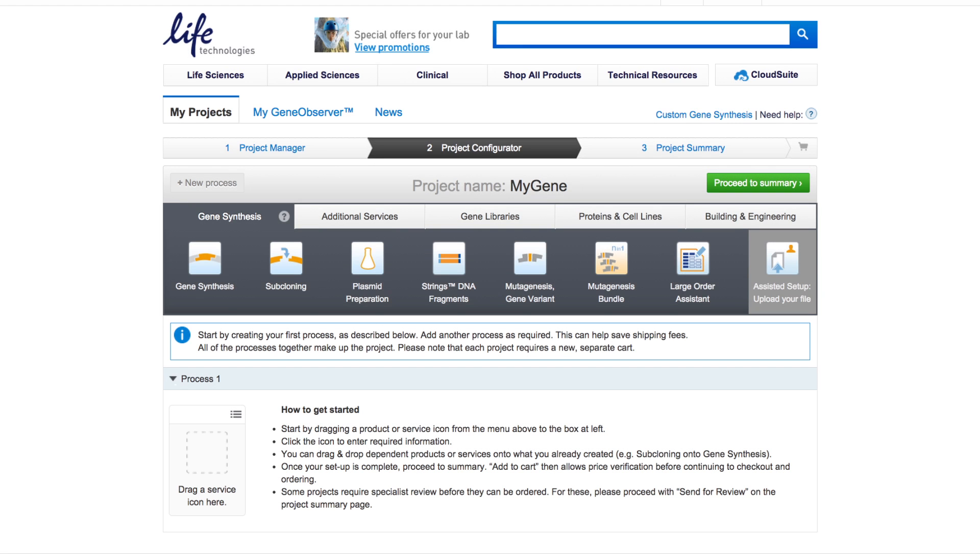Genart Large Order Assistant. The Large Order Assistant supports efficient ordering of large projects. Up to 50 strings DNA fragments or fully cloned genes with optional subcloning and plasmid preparation can be handled in one process.